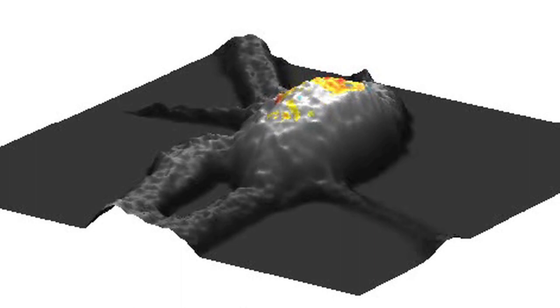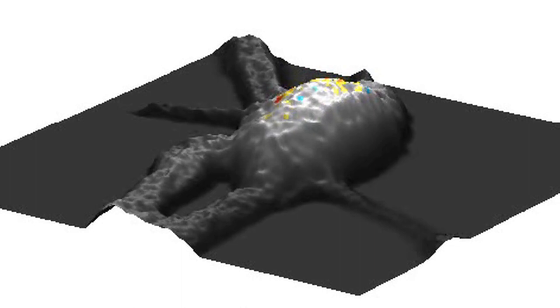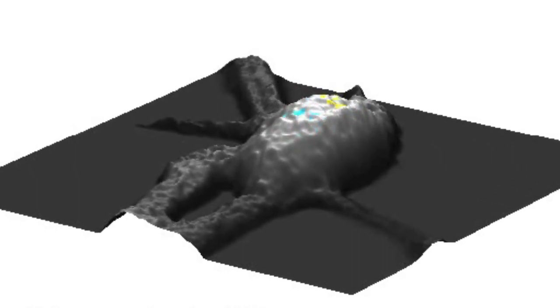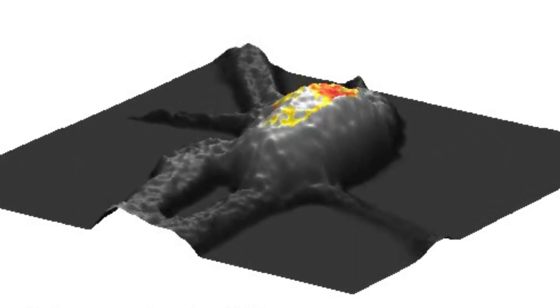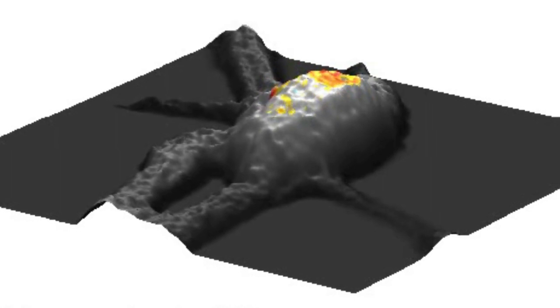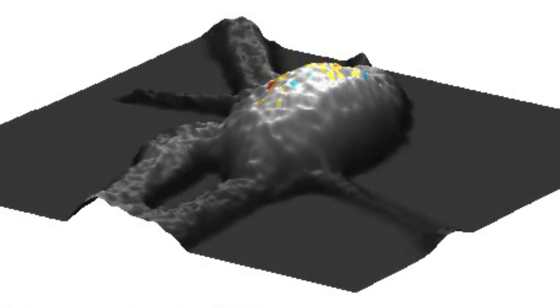We have developed a technique that allows us to visualize neurons and actually any other cell type in three dimensions, in a non-invasive manner and without any dye, with very high resolution both in space — a tenth of a micron, for example — and in time, with a video acquisition of up to 500 images per second.